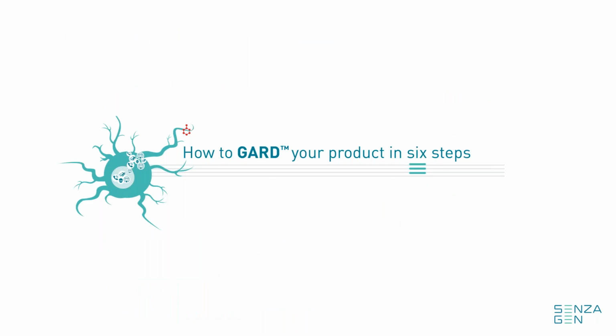Having defined all the different modules of the GARD platform, I would now like to continue the next part of this webinar and explain how we use the finished model to provide hazard assessment of unknown substances in only 6 steps.